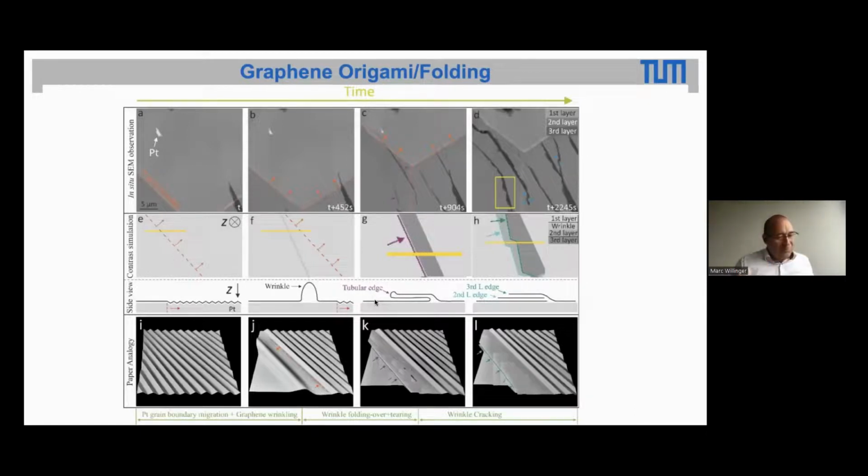Now, as we control the growth process, we can actually etch this highly curved graphene fold with hydrogen. Graphene can easily be etched when it is geometrically very strongly bent. So we can etch this open with hydrogen, and we make two new growth fronts. And these then continue growing, and you see that the surface first layer is some gray level, the second layer is this layer, the third layer is that layer.